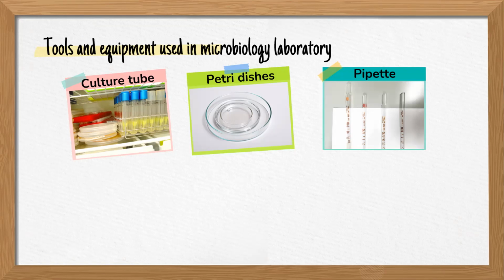Bacteriological pipette. In vitro bulk, liquid, or solid inoculation requires a pipette. There are many sizes to suit the type of work. There will be a cotton ball plugged at the end of the pipette to prevent contamination, and the red rubber ball must be used to aspirate a solution when using a pipette. Do not use your mouth.